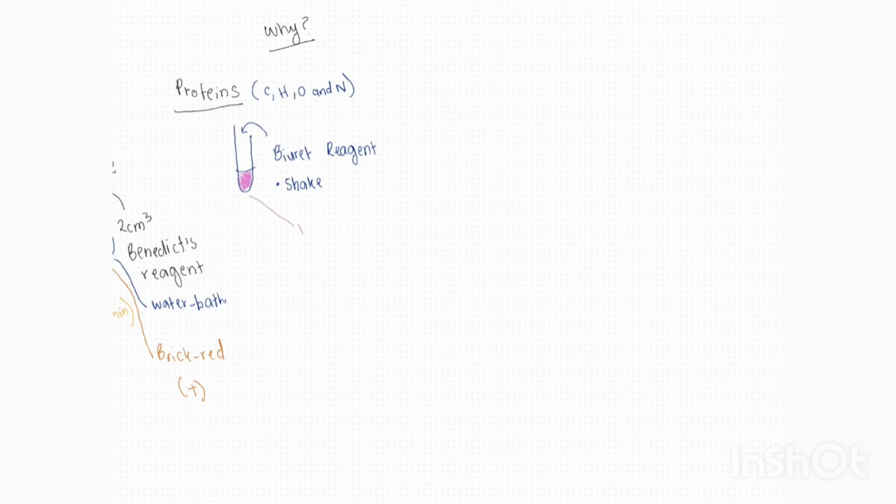Okay, I hope this is the right color. But yeah, along the shades of purple, if it's purple or mauve color, that means that your sample had protein present in it. So positive for protein.